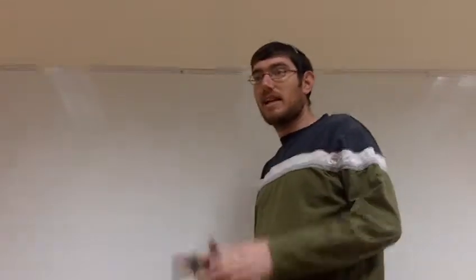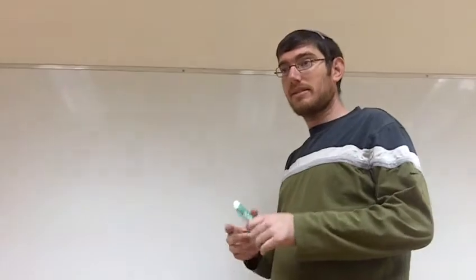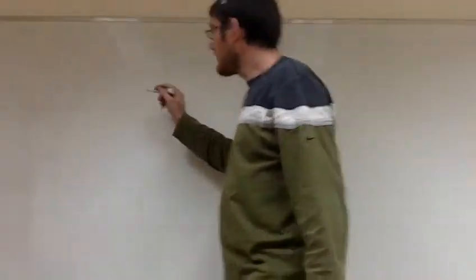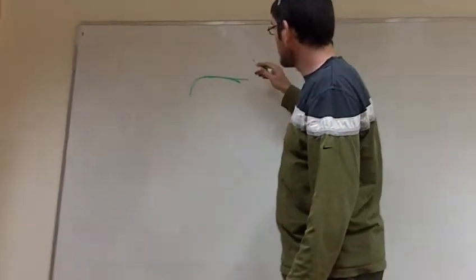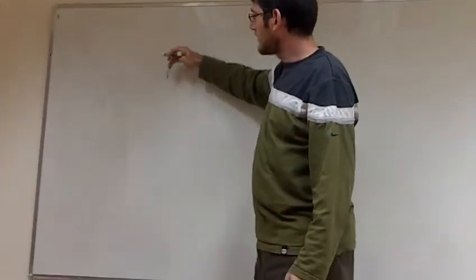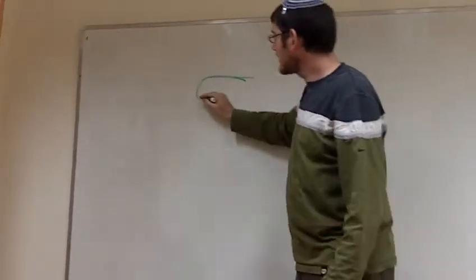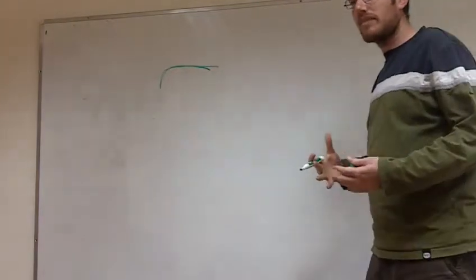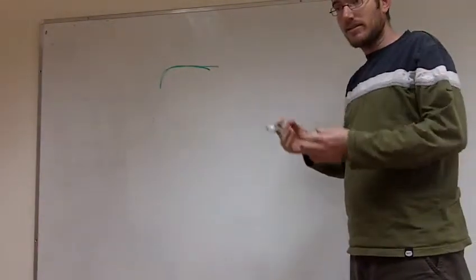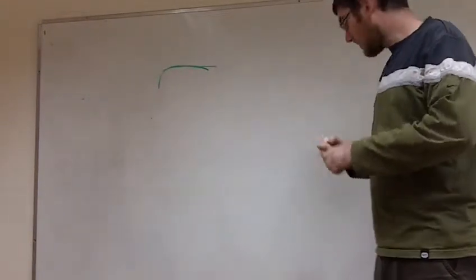About the MV1000. I'm going to start with that. So let's start from the really basic. We have a tip. Our tip looks something like this. This is the cantilever, and then we have it bent, and this is the end of the tip. The end of the tip in a regular AFM is like 20 nanometers at the end. We have different tips, but we're talking about the AFM tip, the most simple one.